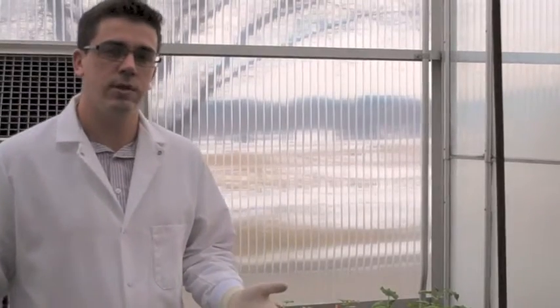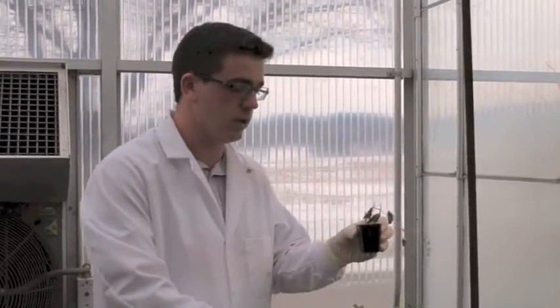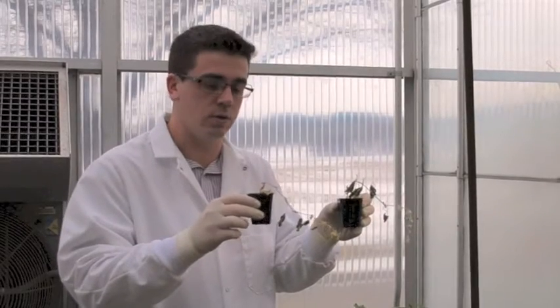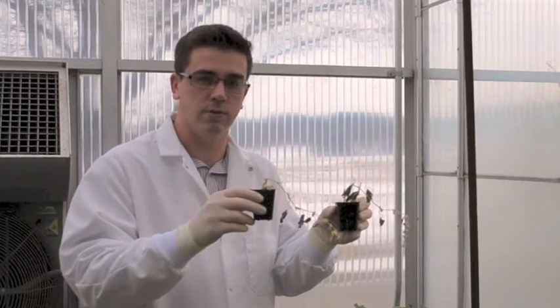So once the bacterium has been transformed and has shown similarities with the wild type, studies of virulence need to be performed. Here in this small greenhouse experiment, we are showing the wild type inoculated onto cucumbers and the transformed isolate also inoculated onto cucumbers, showing that the transformation did not affect its virulence.